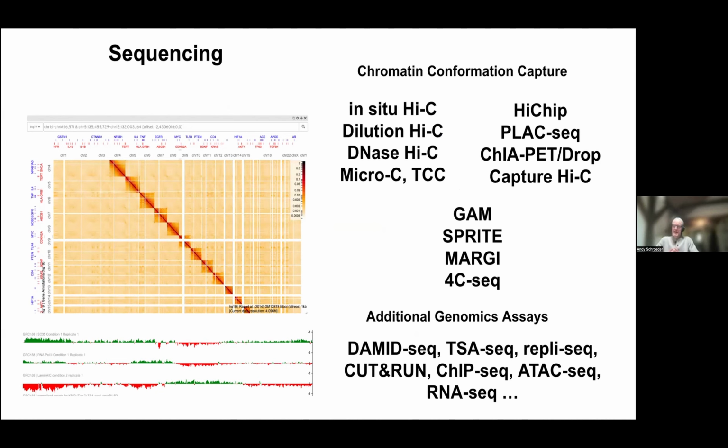So for sequencing data, this is where things started. The workhorse is chromatin conformation capture, more colloquially known as Hi-C.